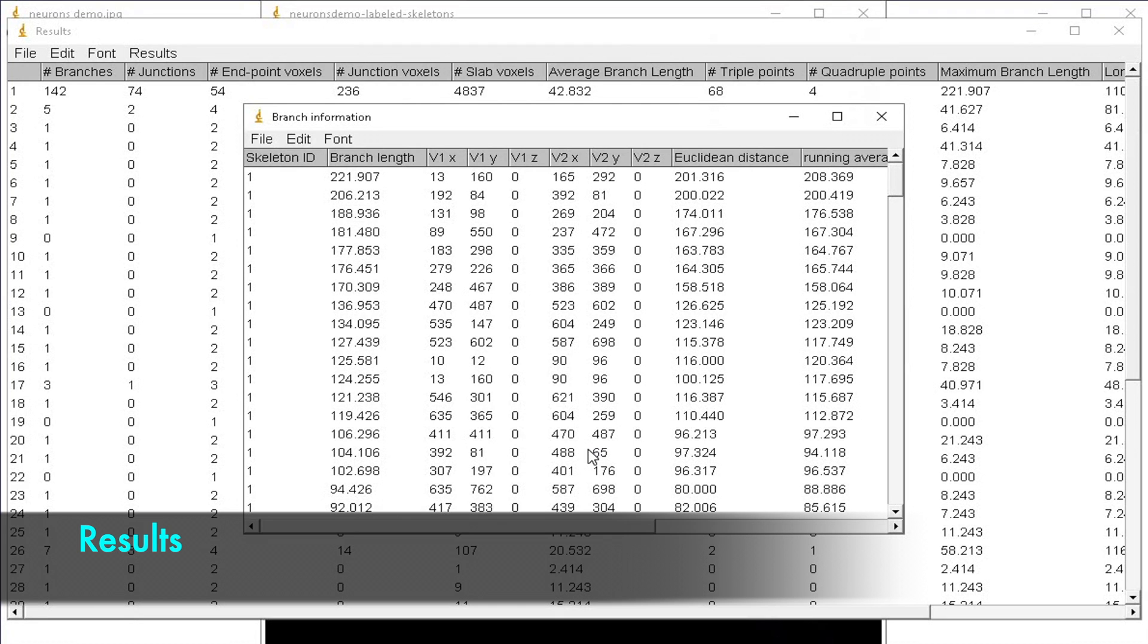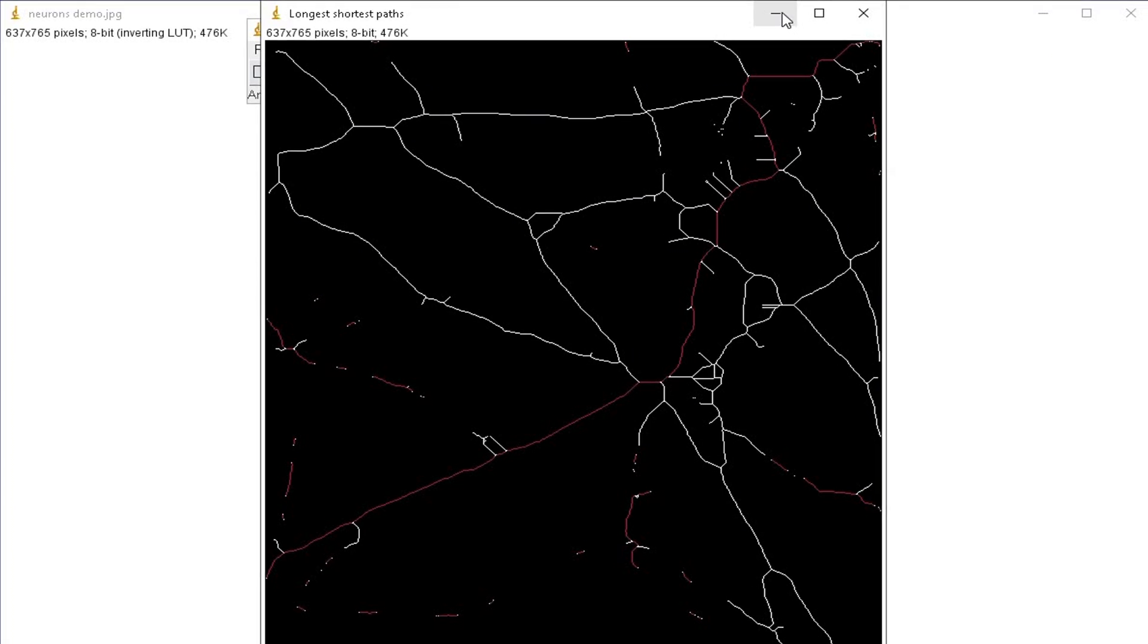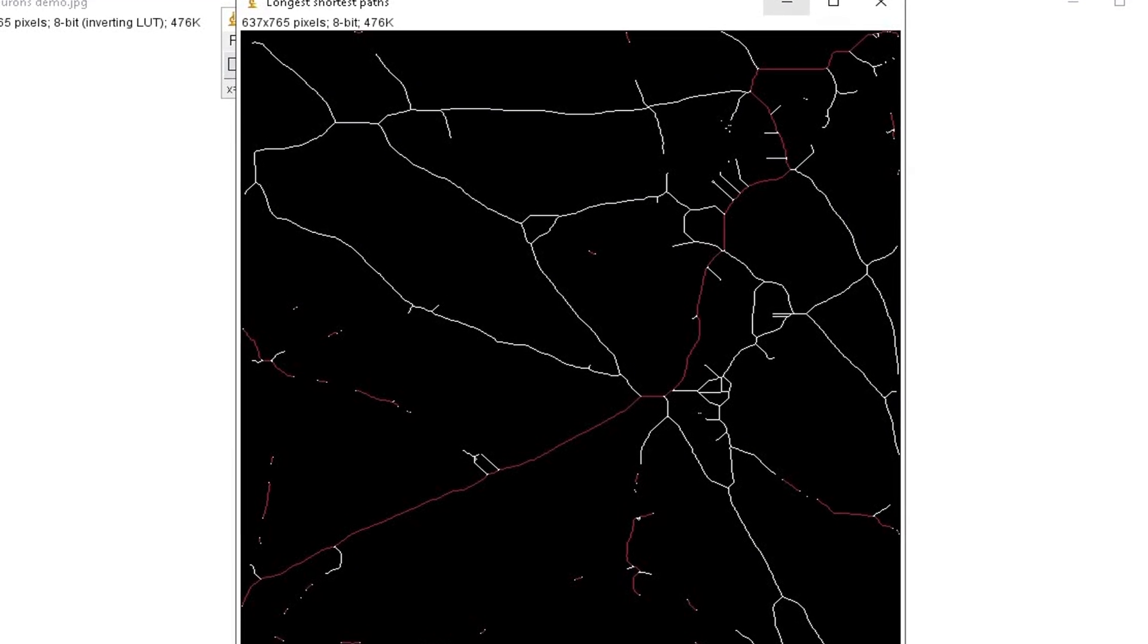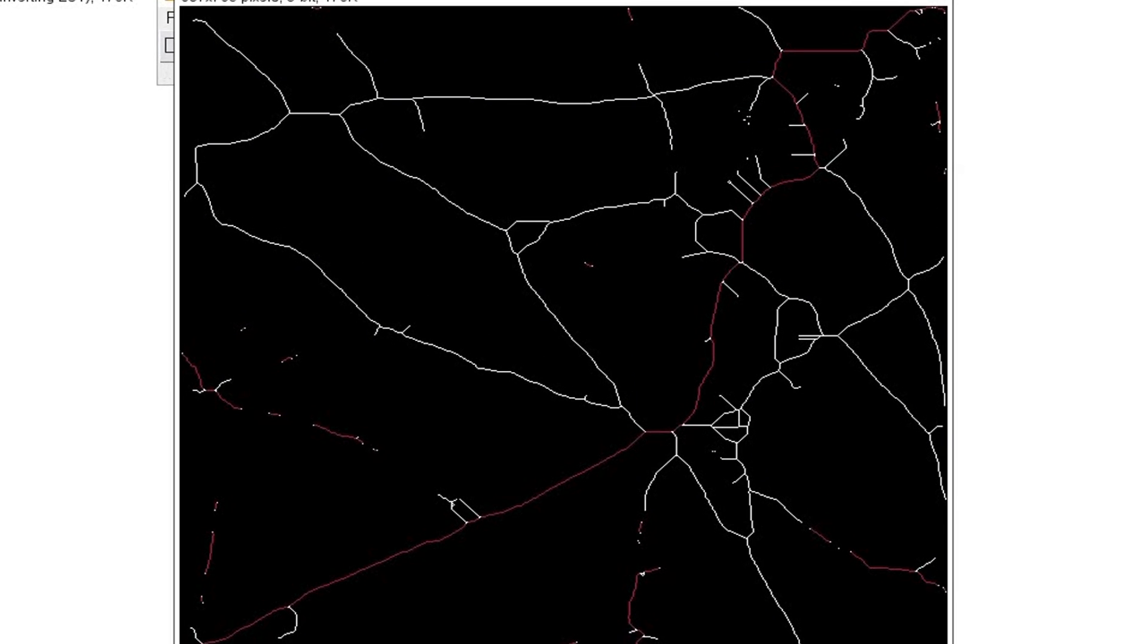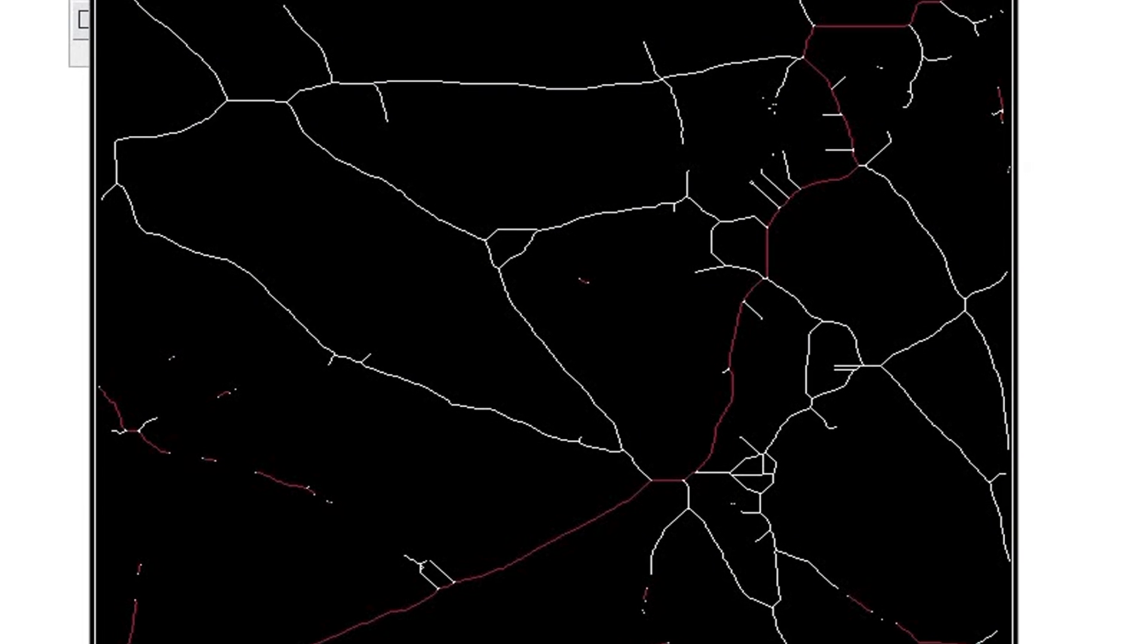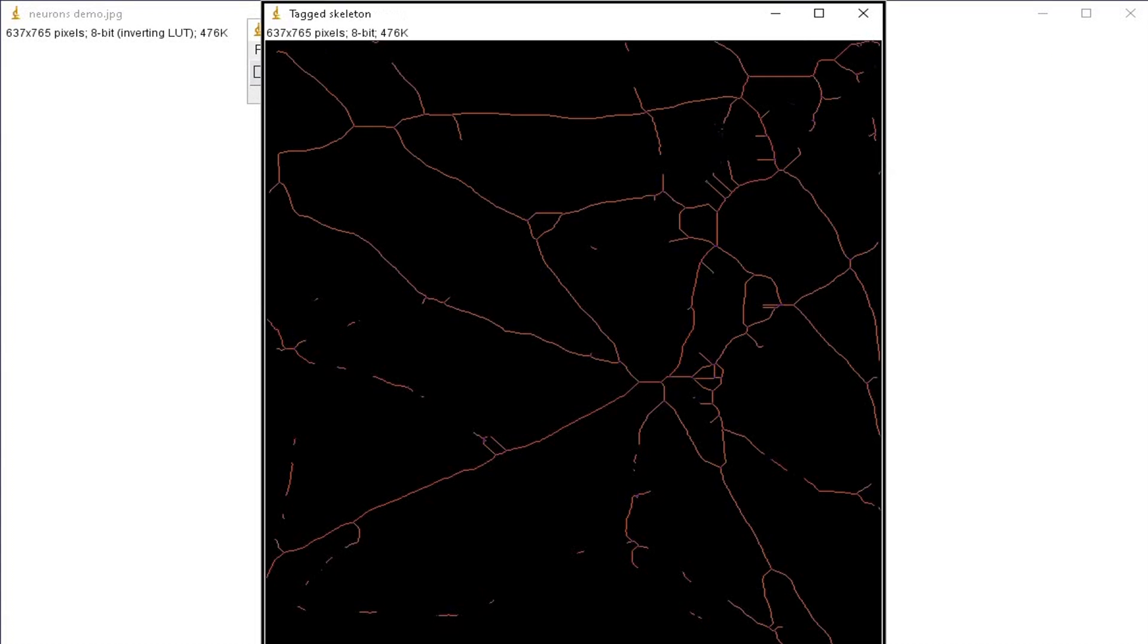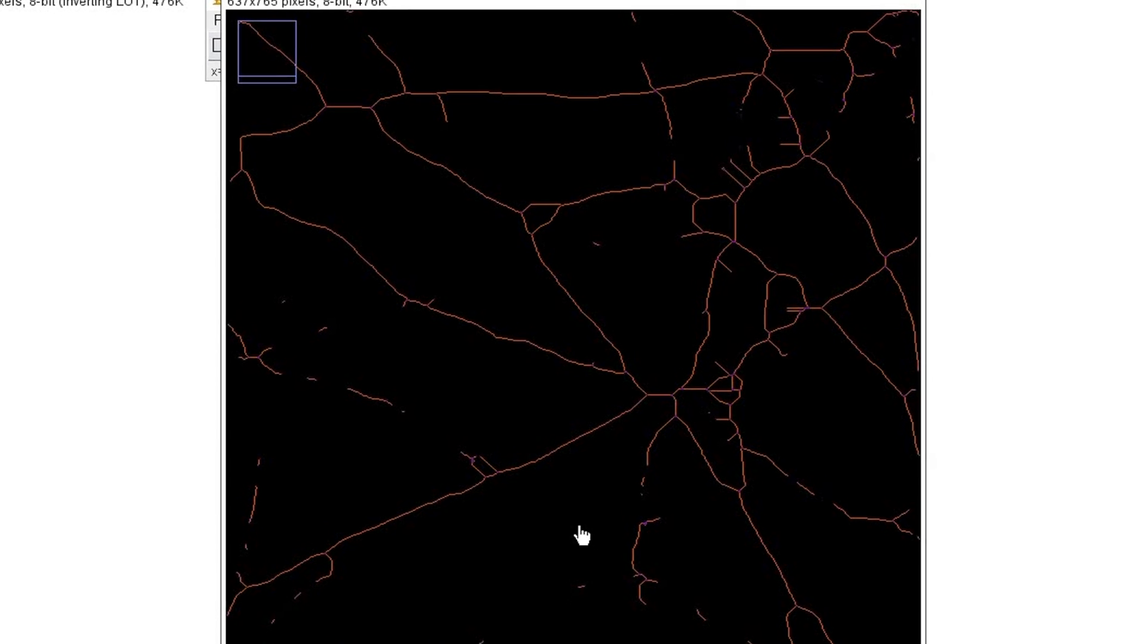A bunch of information is displayed at this point. Let us analyze them separately. This image from the result displays the longest shortest path. In this case, the longest path is displayed containing the skeleton in white and the shortest path in magenta.